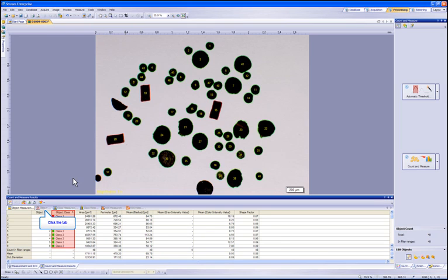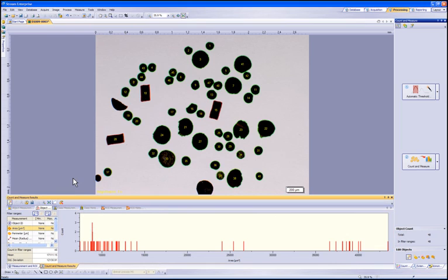Next, let's show the object filter window. Within this window, you can perform filtering of particles by any of our measurement methods. Some examples would be to filter by size and area, shape factor, diameter, or max length.